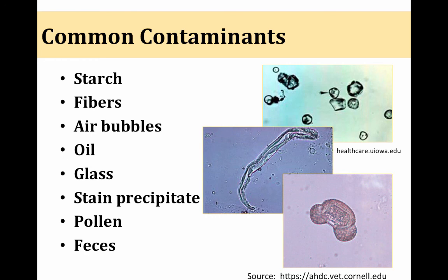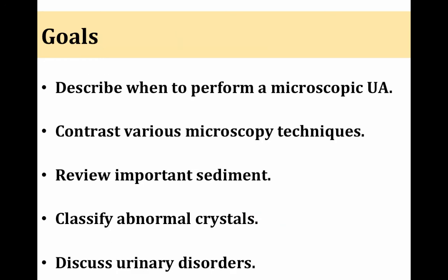So be aware that there are many times when this can happen, and that you need to, if you're questioning something, look it up or ask, and not just guess. So this sums up our microscopic finishing touches. Make sure to review your objective sheet and prepare for your exam next week. If you have any questions, you know how to get a hold of me.